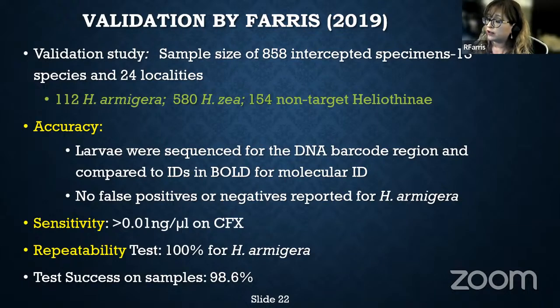So we had 13 different species from 24 different localities. The only difference was that at our laboratory, we didn't use adult specimens because we didn't have any, so we utilized what the other laboratory, which used the adults, provided to us. And then we took additional samples. We had larvae, and we sequenced them for the barcode region, and we compared those IDs to the BOLD database for molecular ID as well.